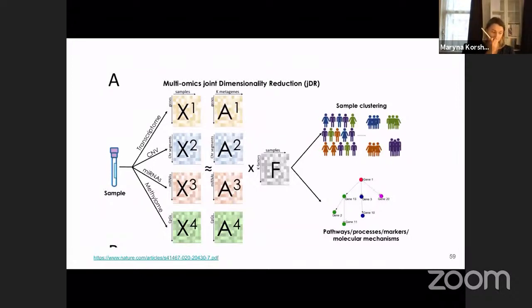The idea is that you have to transform your raw matrices, doing some matrix operations, in order to first overlap these different markers and types of data for different cell types, and after that assign them to different metadata and do this grouping and interpretation on a higher level.